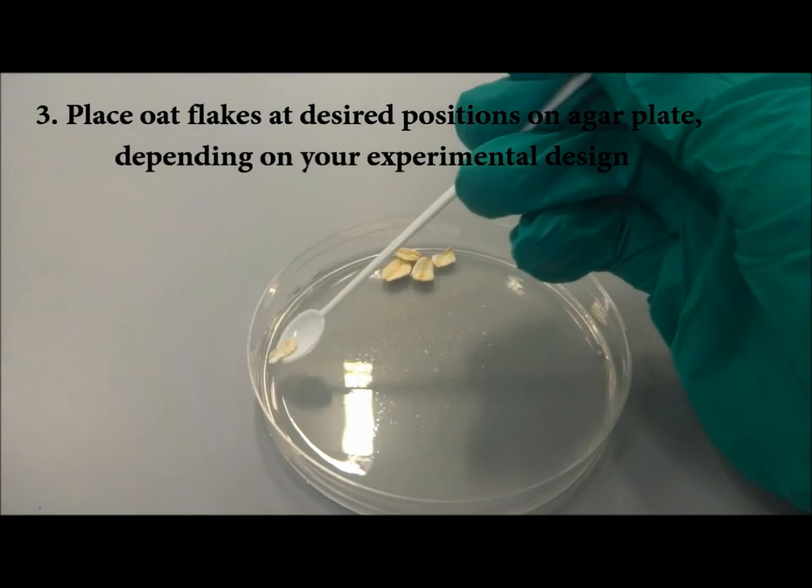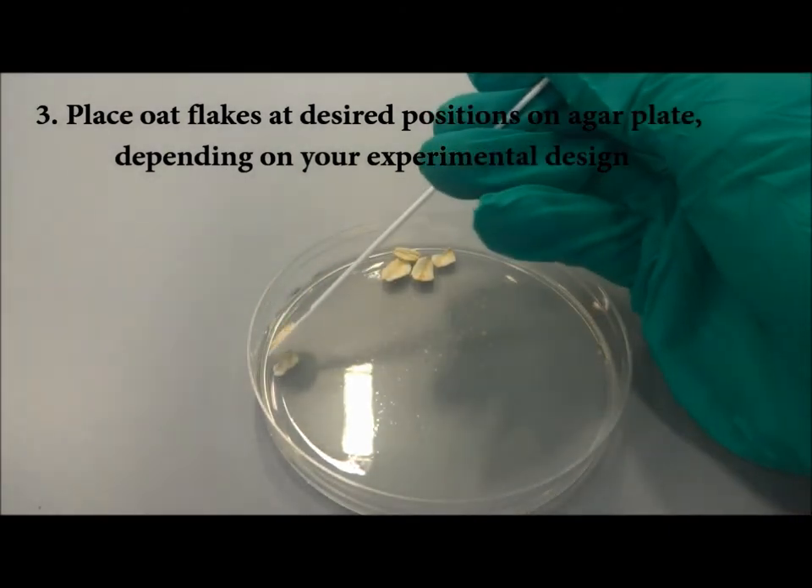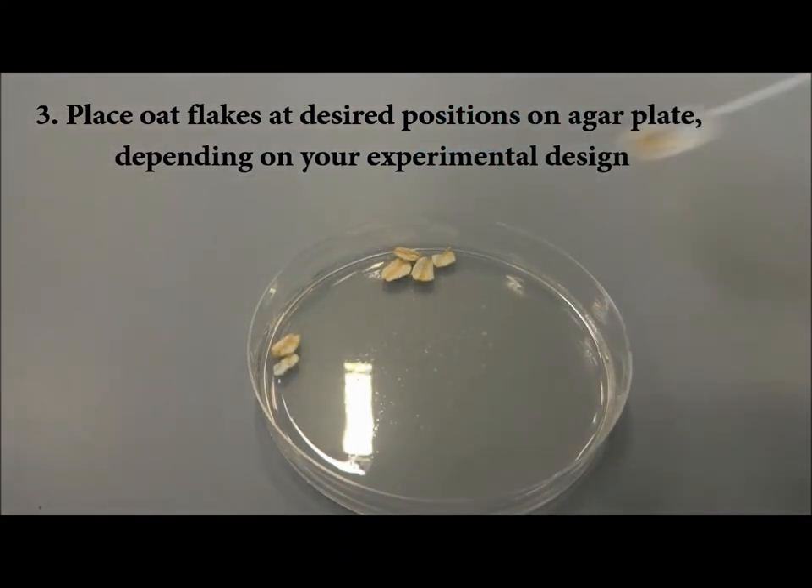In this example shown, the oat flakes are placed near the rim of the plate, so that the slime mold can migrate towards them from the center.